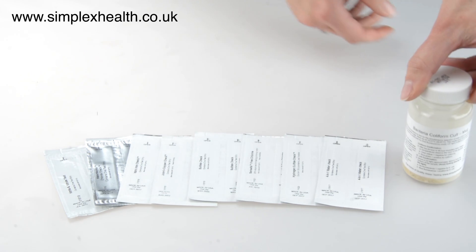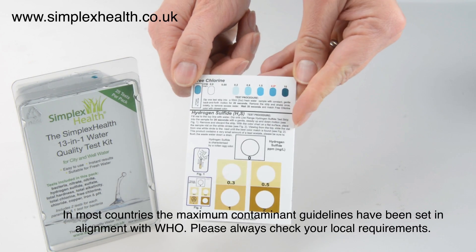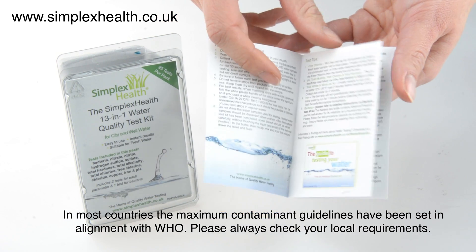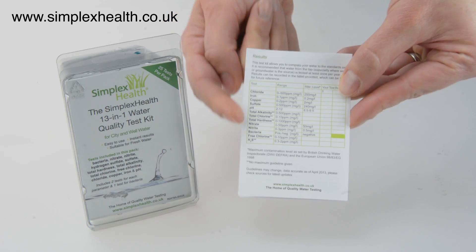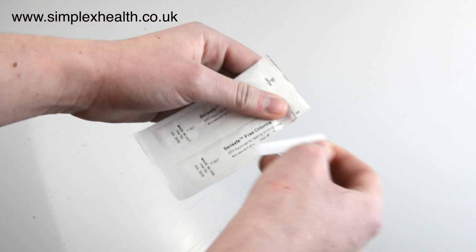Each pack also includes detailed instructions, a color chart as well as a table where the results can be noted down and compared to maximum guidelines. We suggest reading all of the instructions carefully before starting any of the tests. Make sure that you use a fresh water sample for each test. Each test strip is individually sealed for protection — only remove them from the foil packaging just before they are being used.